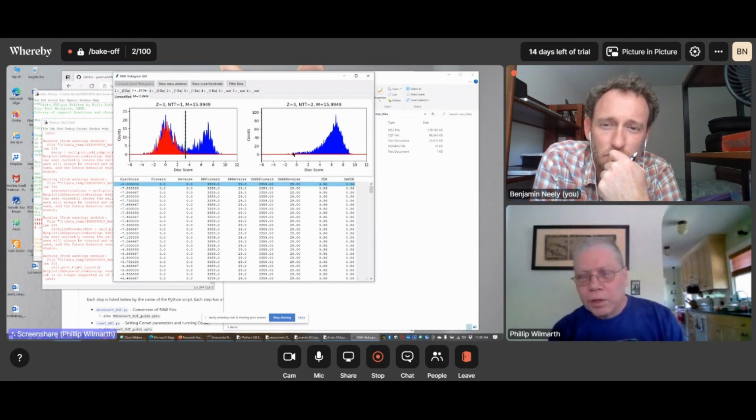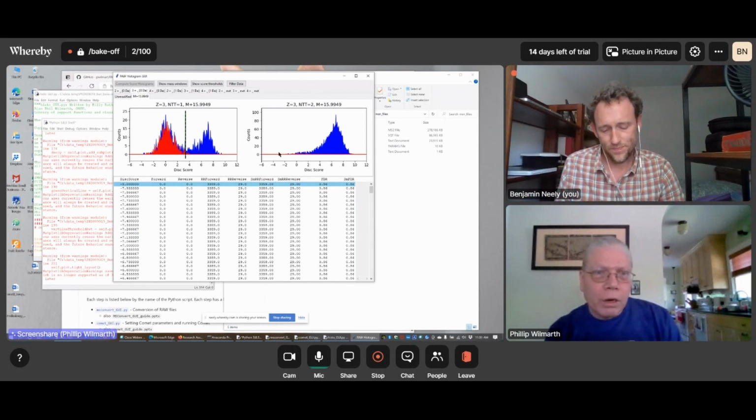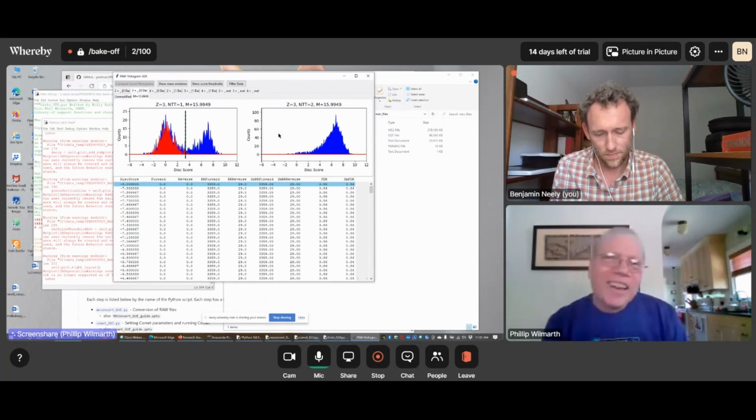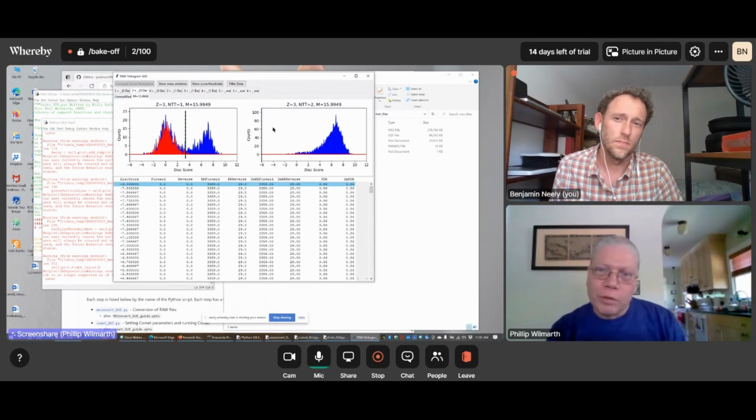When we see something like this where we don't have a dotted line set, that means we never hit 1% FDR. So the threshold's basically sitting out here at -6. So we're not really needing to invoke any discriminant score cutoff for that to get our 1% FDR. And if you look at that, we're starting at 0.86%. And that just shows the power of using that delta mass approach up front. You've basically eliminated essentially all the noise here in the fully tryptic matches for the 3+ peptide.